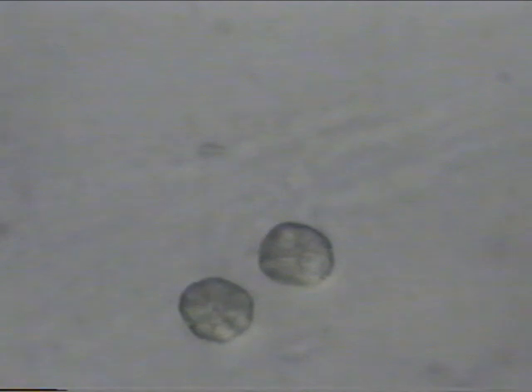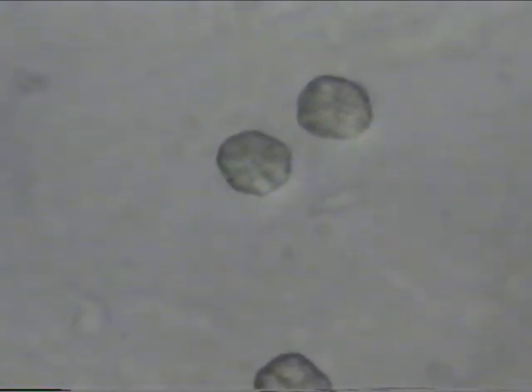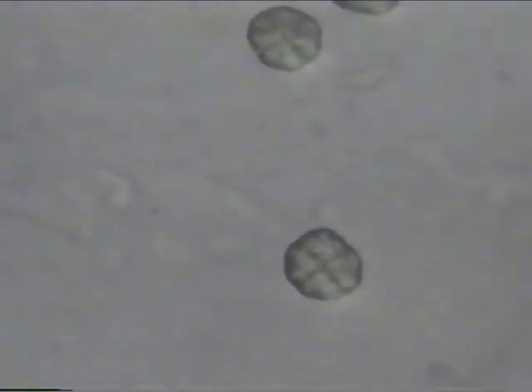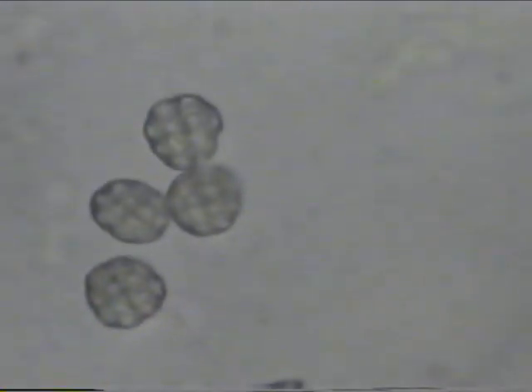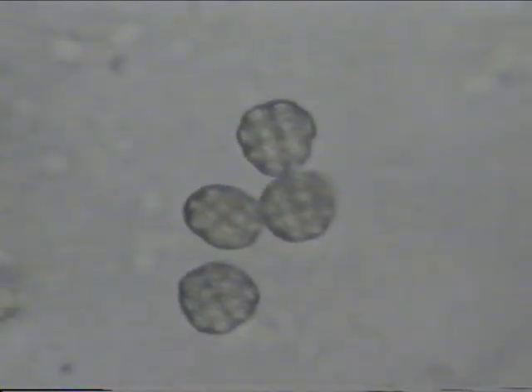Here we are at a very high magnification looking at actual pollen grains from a flower that we just collected from outside. Look at the structure of each pollen grain. No wonder they make you sneeze.